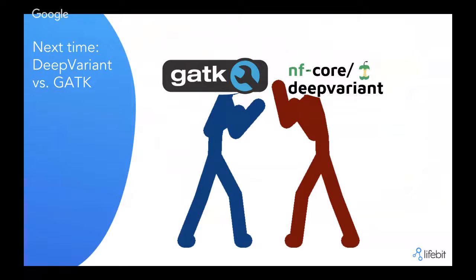And for those of you who are mostly interested in benchmarking and seeing the performance and accuracy of DeepVariant in general, for the next webinar we are going to be having this fight between DeepVariant and GATK, where we are going to show how to run this kind of benchmark for a reference data set, and what the results are, so that you can have a better informed decision on which one you should be choosing. If you are interested in these kinds of questions.